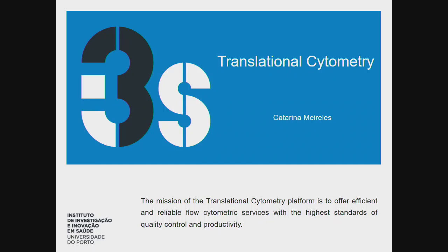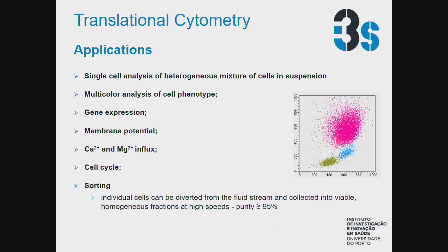I have the pleasure to introduce you to the translational cytometry platform. And as you can see by the name, we work with flow cytometry. Our aim is to offer efficient and reliable flow cytometric services with the highest standards of quality control and productivity. So flow cytometry can have several applications.